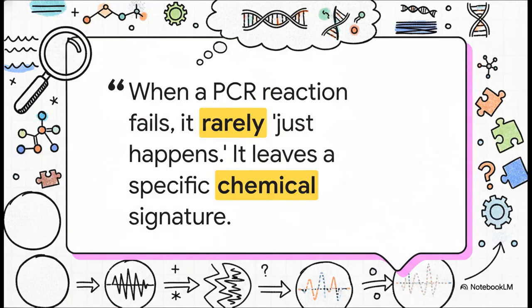You know, a failed PCR reaction isn't just bad luck. It's a deterministic outcome. Every single failure, whether it's a total catastrophe or just a partial result, leaves behind a very specific chemical signature. Your job is to read that evidence.